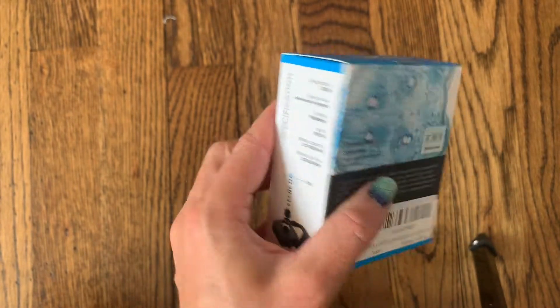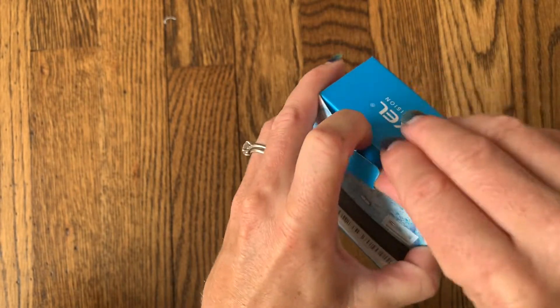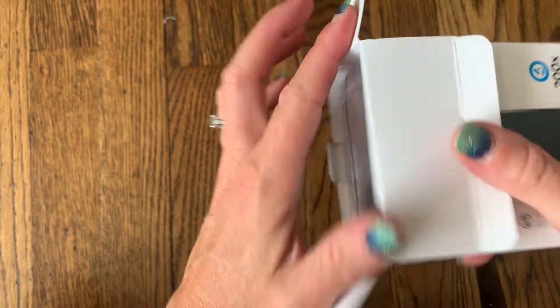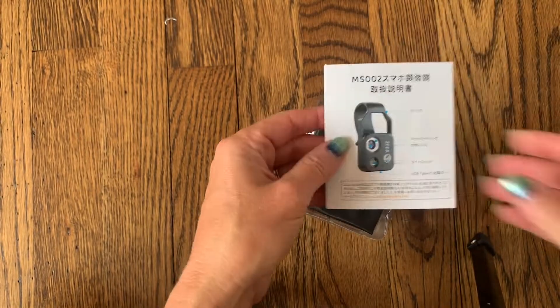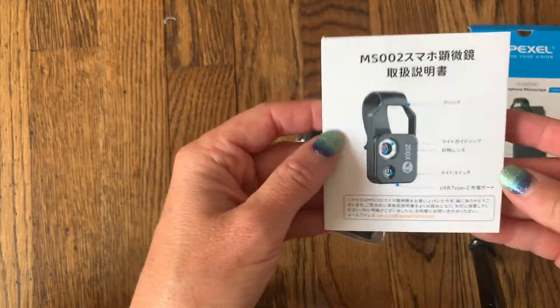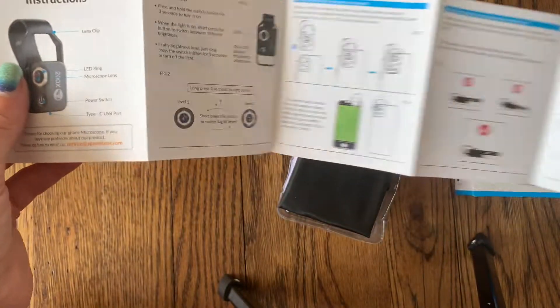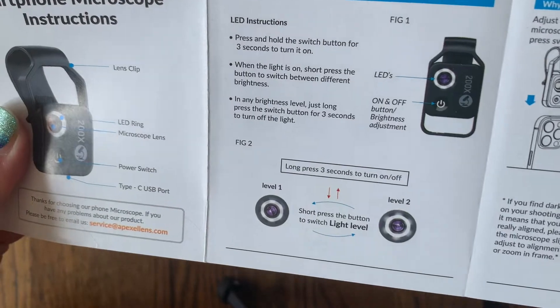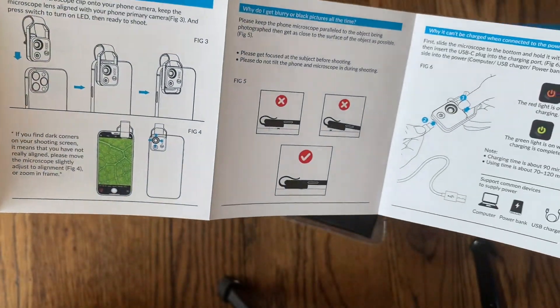It has a rechargeable built-in battery that will charge for about an hour and then last up to four hours of use, so it's really convenient. I'm just going to open the box and show you what's inside. First thing I see is a quick user manual and instructions — this is going to tell you exactly how to set it up, a little bit about the on/off button, how to adjust the brightness, how it works, and how to get it connected and charged.